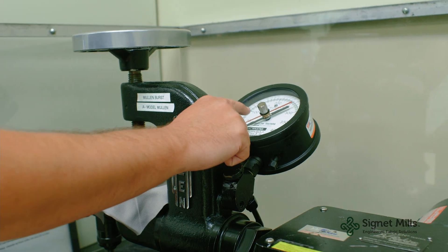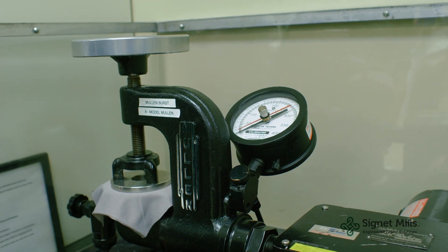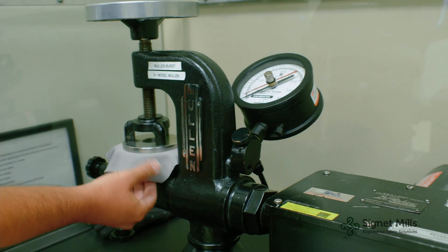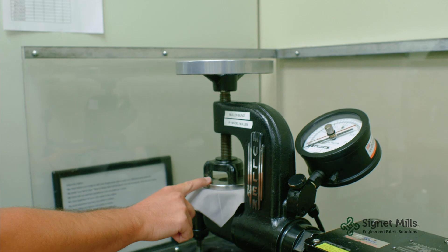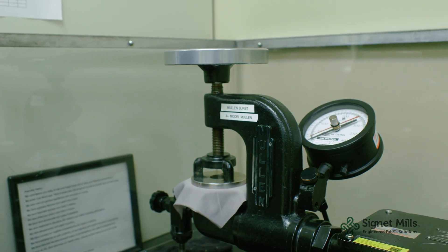The gauge here will read out a red gauge and a black. The red gauge is the amount of pressure it takes to actually inflate the diaphragm. The black is the actual burst strength. Just subtract the two to get your total burst strength.